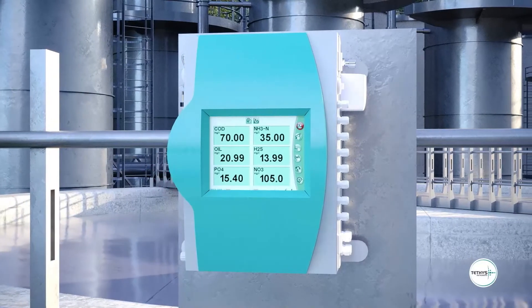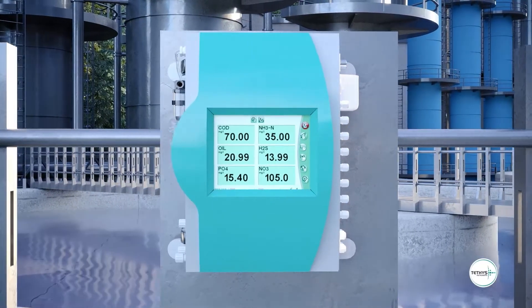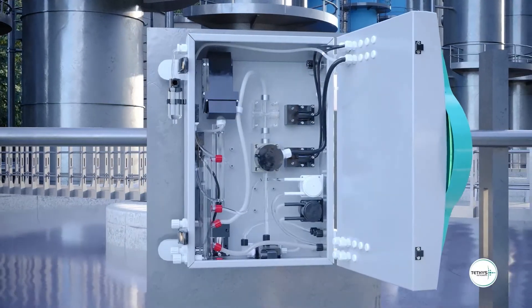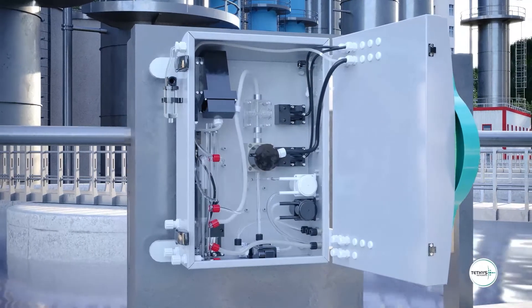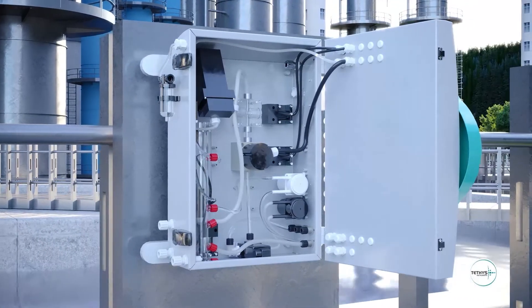The measurement is based on the UV absorption of the hydrogen sulfide gas after the stripping phase. The bisulfide ions in the water sample are converted to hydrogen sulfide gas by addition of hydrochloric acid. Hydrogen sulfide gas is then measured by UV absorption spectroscopy.